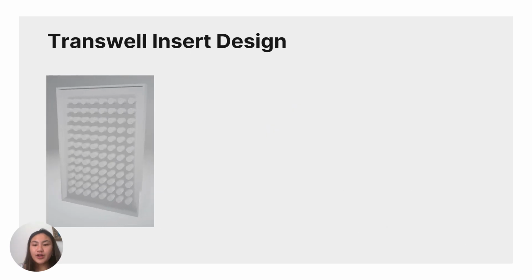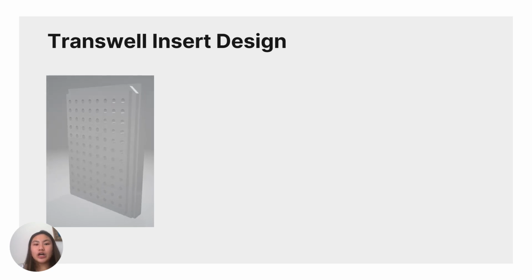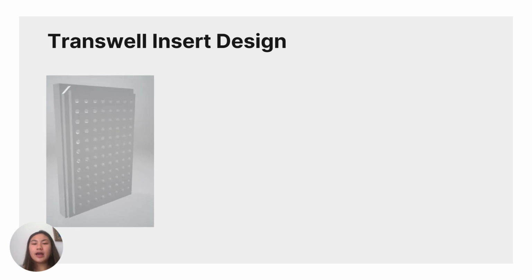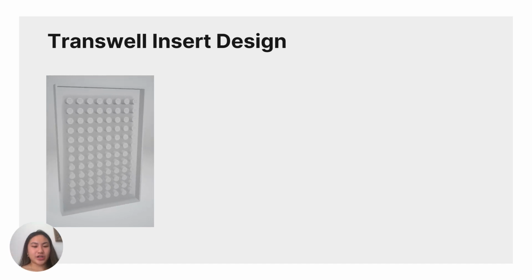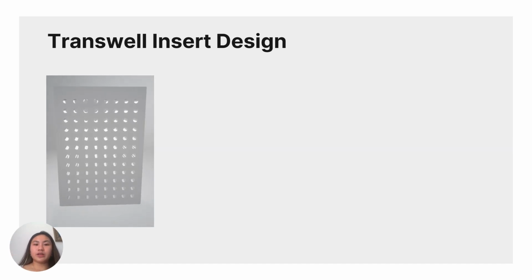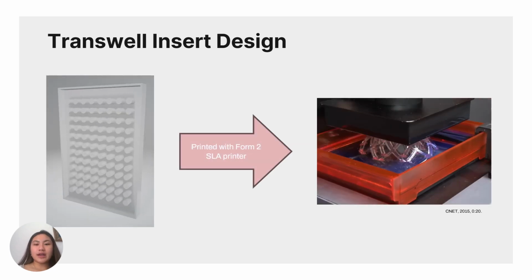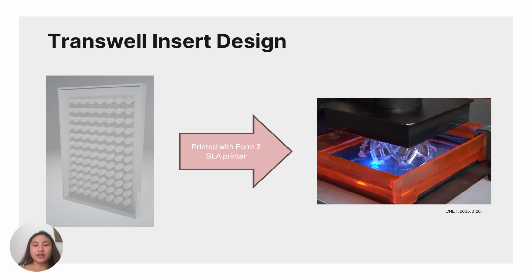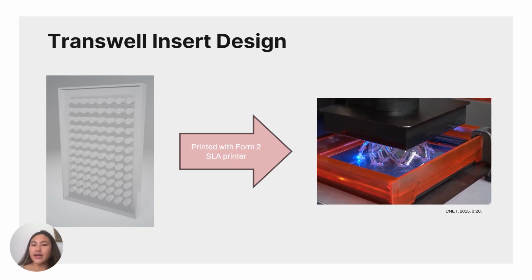So focusing first on the transwell insert design, this is a CAD model of the insert design that I designed myself using the Autodesk Inventor program. After optimizing this model with measurements and doing some prototype prints, we then utilized an SLA printer, also known as a stereolithography printer, to print our design.